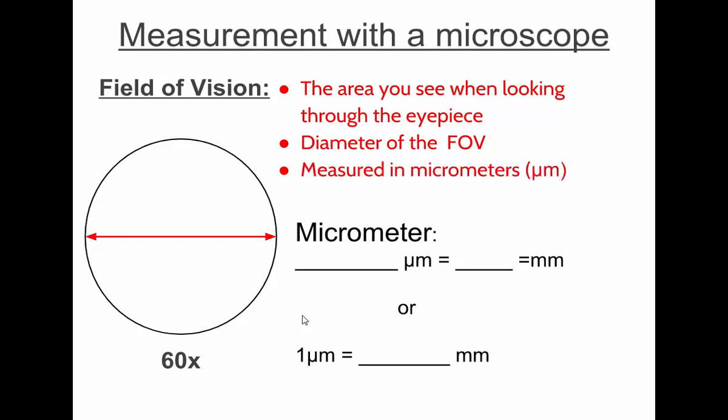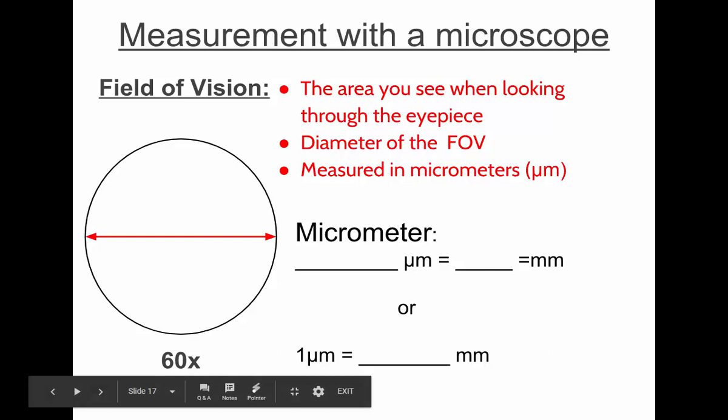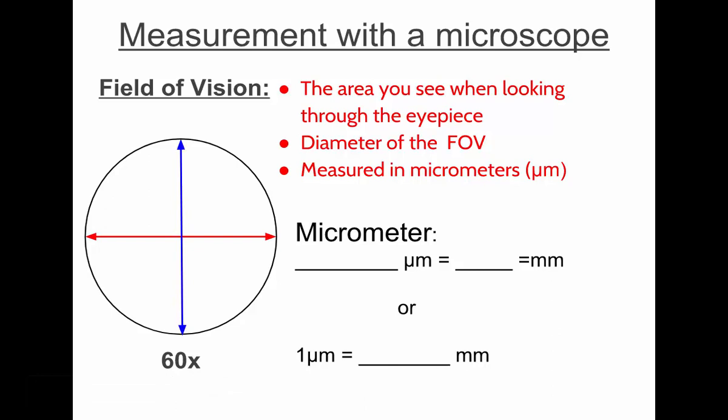It's actually called a micrometer. It has this abbreviation, this little mu symbol. It's a Greek symbol. It looks like a cursive U. Stands for micro. And a micrometer is really small. A single millimeter, those really small markings you see on our metric rulers, there are 1,000 micrometers in one single millimeter, so it's small. We use it when we're measuring small objects. So one micrometer is how much of a millimeter?